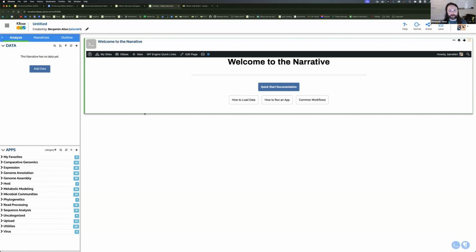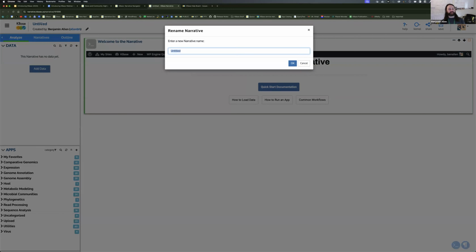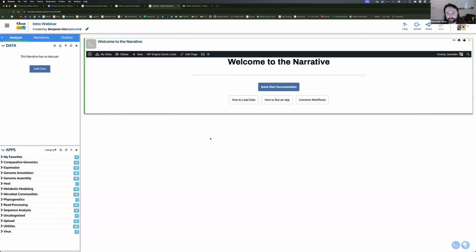The first thing I'm going to do here is provide a title. So I just click the title, which is currently untitled, up in the top left corner. And I will just type in a name here. And this will save a copy of my narrative here.